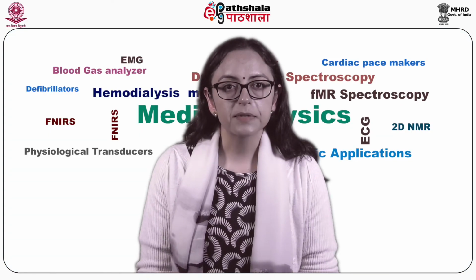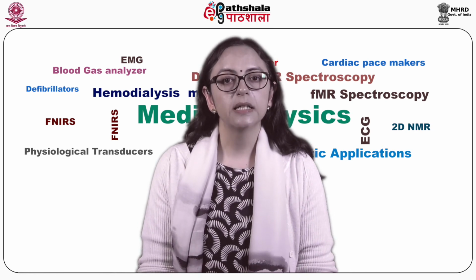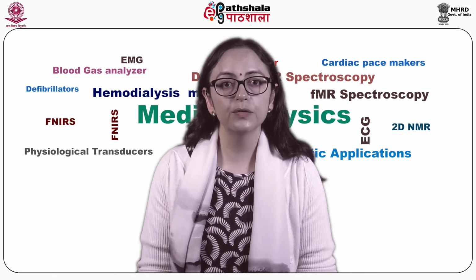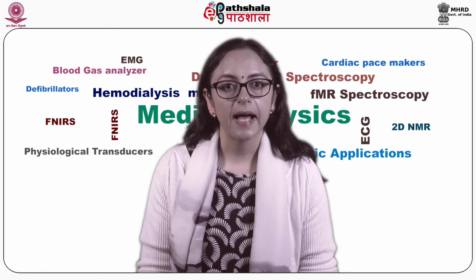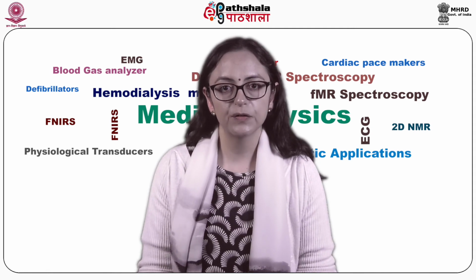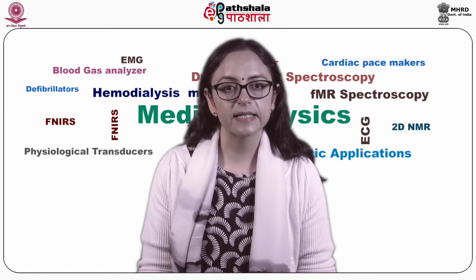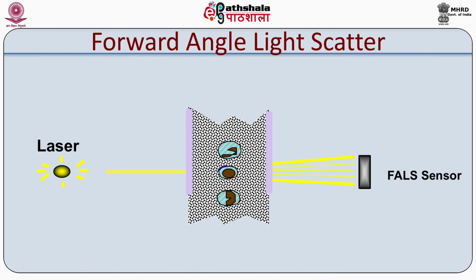So, the optical channels include the forward scatter channel. When a laser light source is used, the amount of light scattered by the cells or particles in the forward direction, as traversed by the light, is detected in the forward scatter channel. The intensity of the forward scatter is proportional to the size, surface area, shape and optical homogeneity of the cells. Shown is a representation of how the scattered light is captured by the forward angle light scatter sensor, which is a photodiode.